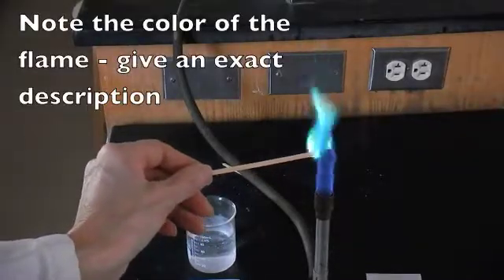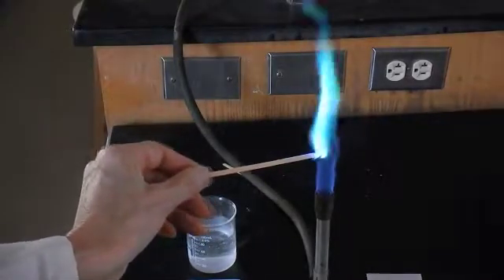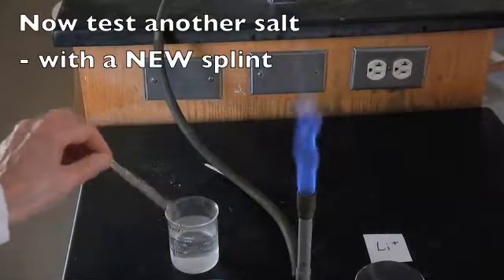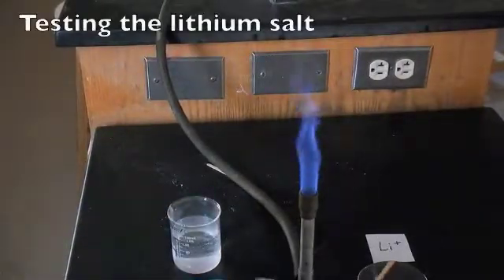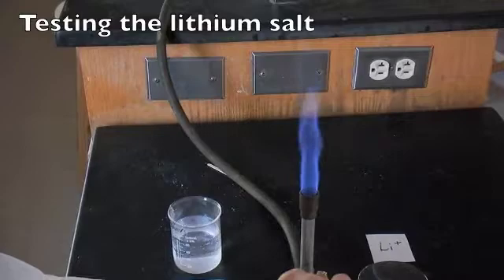The heat is going to allow the electrons to rise to an excited state, and the colors are given out when the electrons come back.